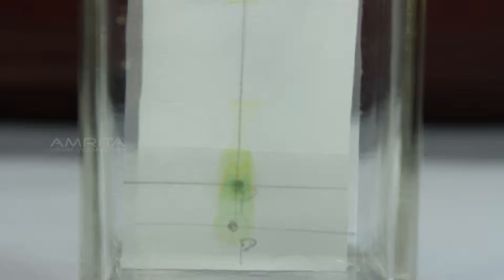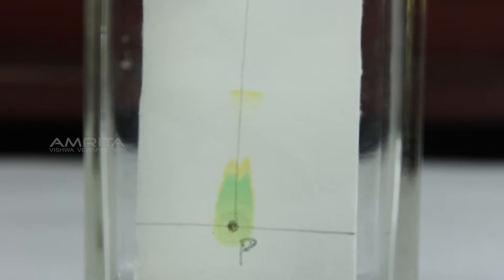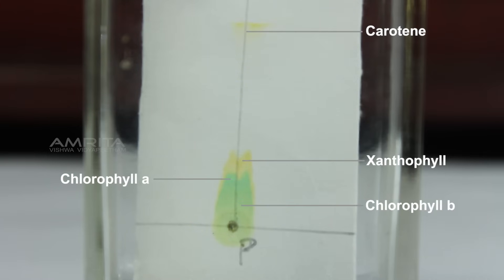Notice the rising solvent along with the leaf extract. As the solvent has risen, you will notice different spots of the pigments such as carotene, xanthophyll, chlorophyll A and chlorophyll B of spinach leaf extract on the filter paper.